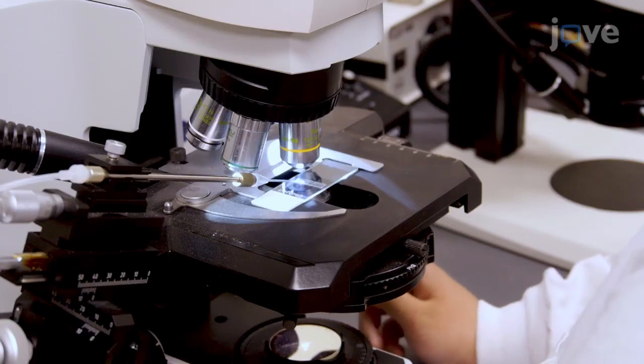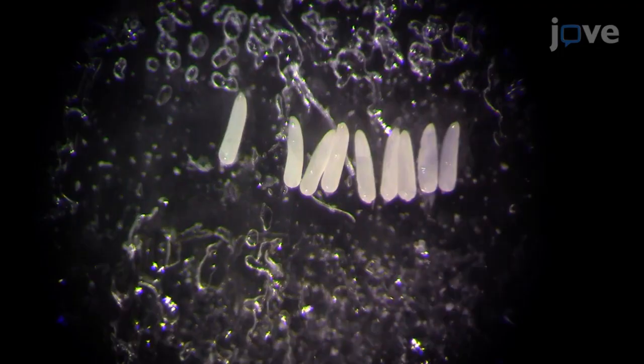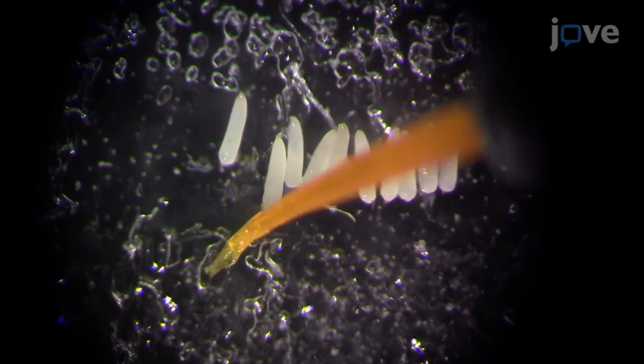This microinjection protocol has been specifically designed to accommodate the unique biological traits of Culex quinquefasciatus, including egg collection, egg raft separation, and post-injection procedures. This method can likely be adapted to any Culex species of interest and can be used to study gene function or to generate genetic-based control technologies for Culex species.